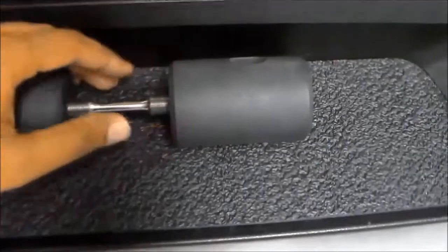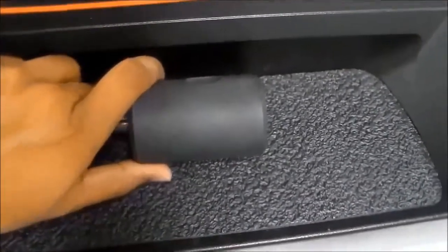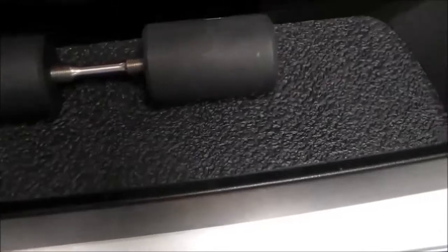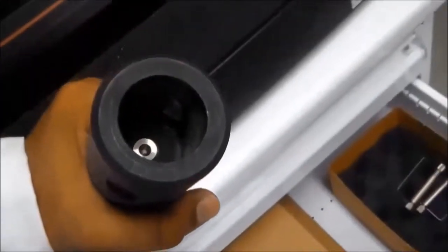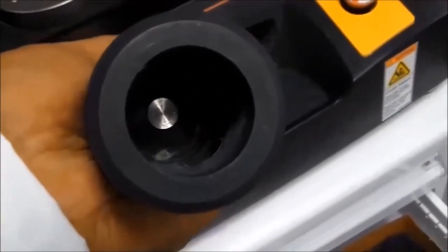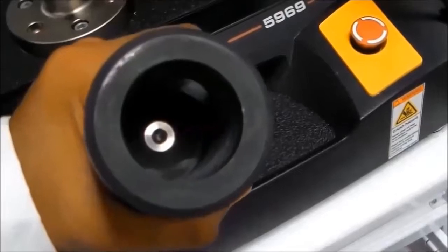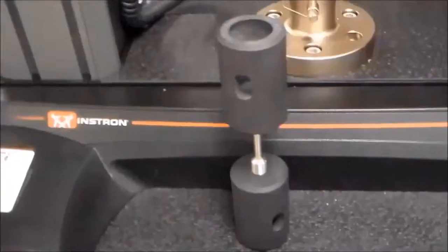To connect the specimen with the grips, rotate the specimen so the threads of the specimen go into the grips. Make sure the specimen is well inside the grip by looking at the side to confirm it goes through all the threads. Otherwise the grip may not hold the specimen and it can slip out during the test.